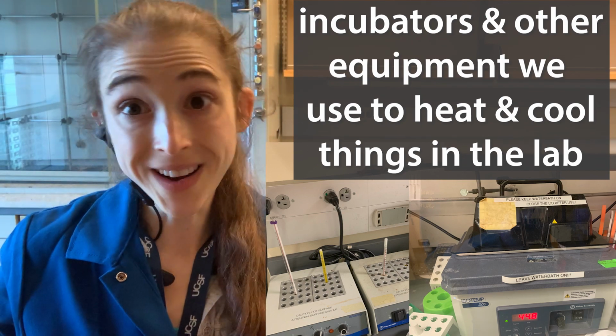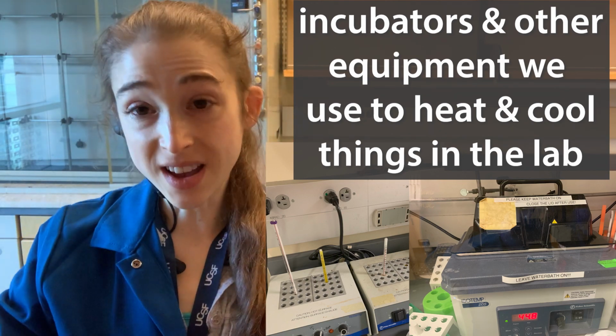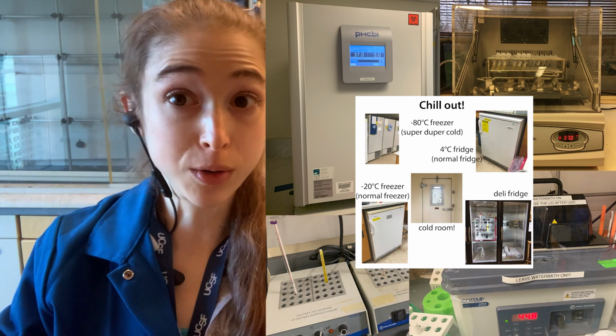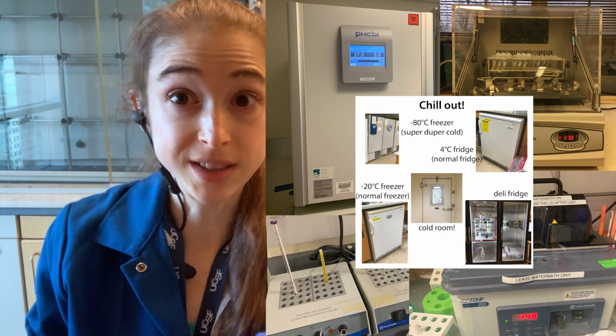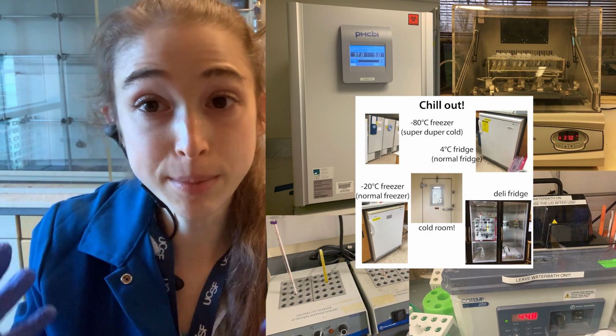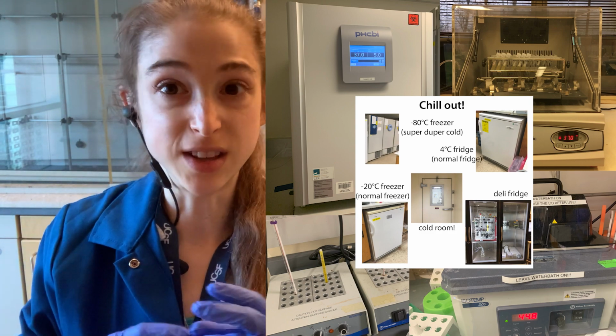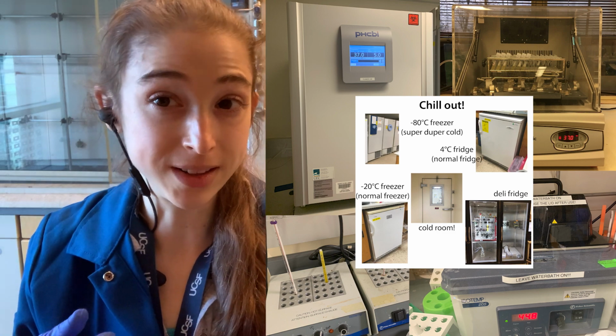As many to date, we've got to incubate. So we have a lot of different equipment we can use to help us keep things hot or cold. Incubation is this fancy word where we keep things at a certain temperature. Sometimes we also control things like the CO2 and the humidity, especially when working with mammalian cells.